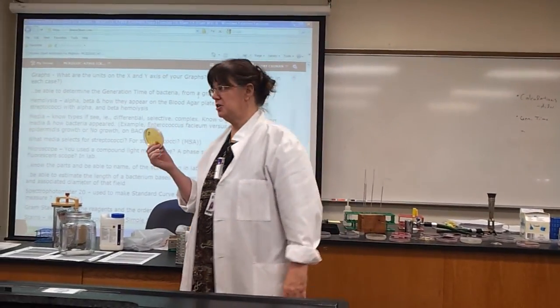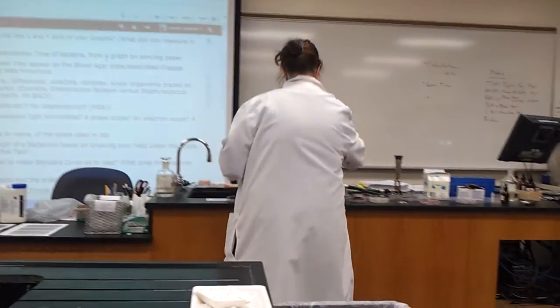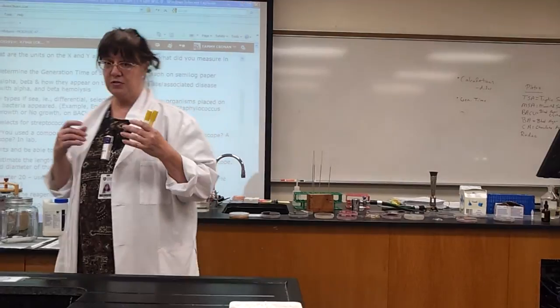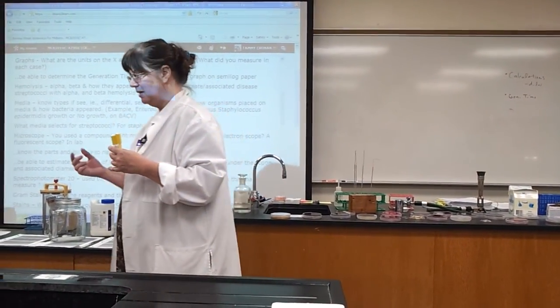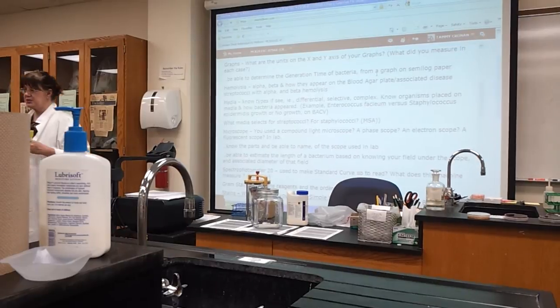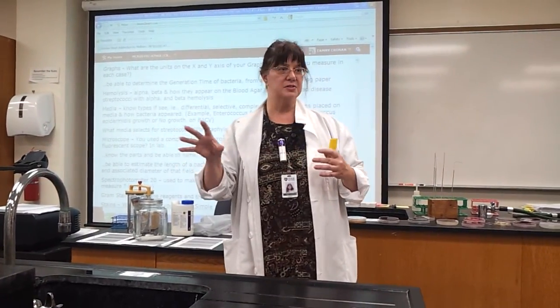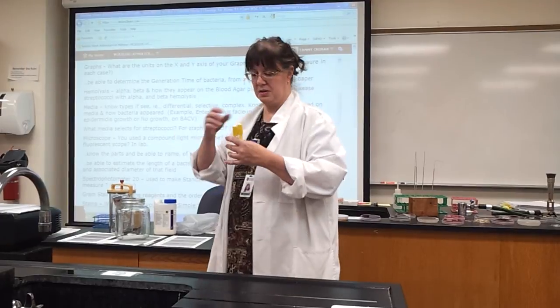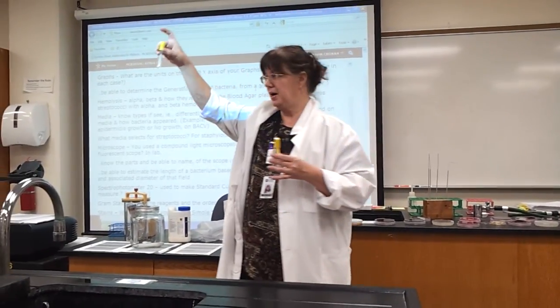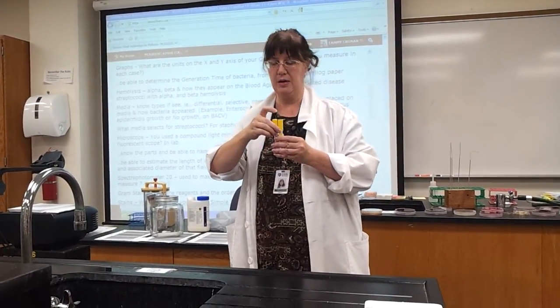It can also cause toxic shock syndrome and other things. We did a test for this. Took a little bit of the culture, put it into rabbit plasma, and this is another presumptive test for Staphylococcus aureus. Staphylococcus aureus, if it's present, can produce what enzyme? Coagulase. What does the enzyme coagulase do? Doesn't break down. It coagulates. It causes a fluid to turn to a gel. Would this be negative or positive? Negative. Would this be negative or positive? Positive. If you saw this, what organism is indicated? Staphylococcus aureus. Okay? And of course the test is coagulase.